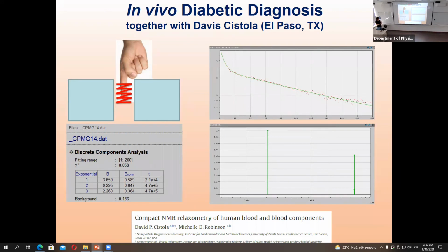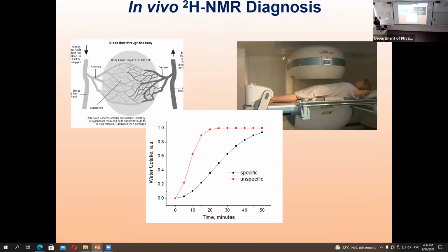The time domain magnets are just cheaper, and of course the field strength we are talking about is normally from 0.5 to 1 Tesla, and in high resolution, the higher the field the better. Thank you.